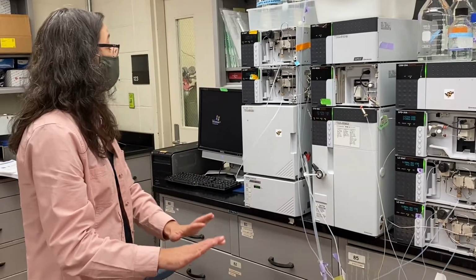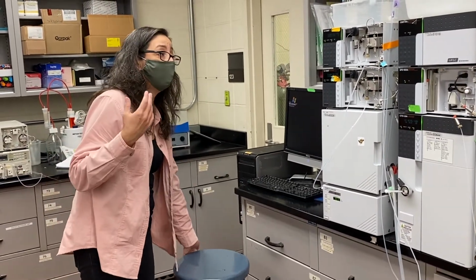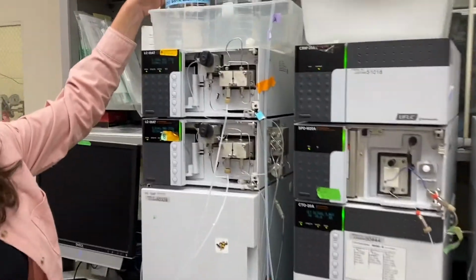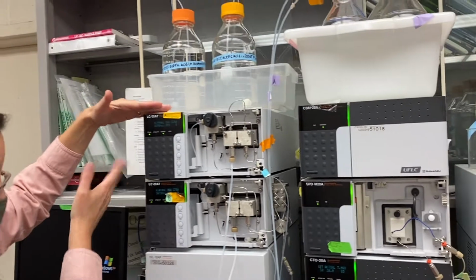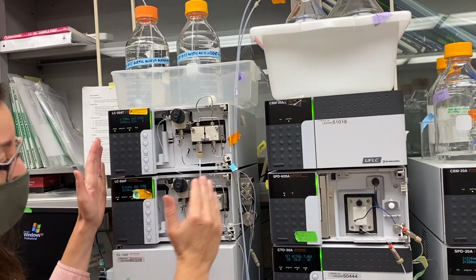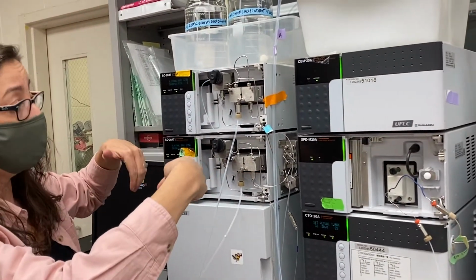Okay. So that's that. Now I'm going to walk you through the different components of the HPLC, which we haven't gotten to in class yet, but we will. So the first important thing you want to know is you have your solvents that need to go into the pumps. Each solvent, in this case, has its own pump. So here, the mixing of the two solvents happens after high pressure pumping. So these are high pressure pumps. Each is pumping at a specific rate and concentration.